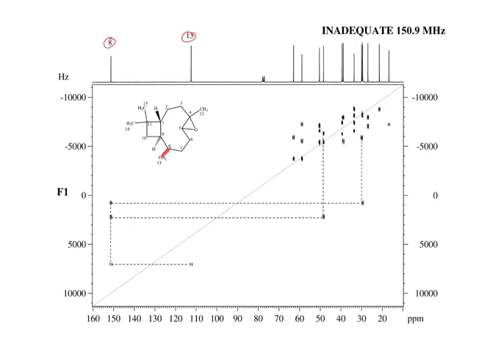Maybe you can optimize the experiment based upon what kind of molecule you have, because if you have a lot of aromatics, then maybe you can set it so it's better to match the coupling constant between aromatic carbons or something like that.